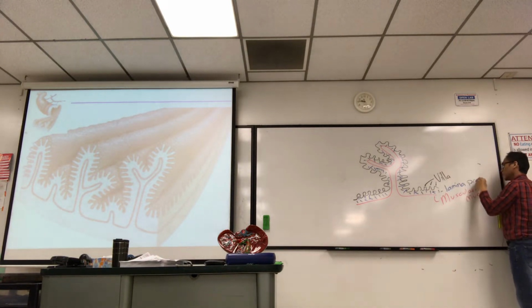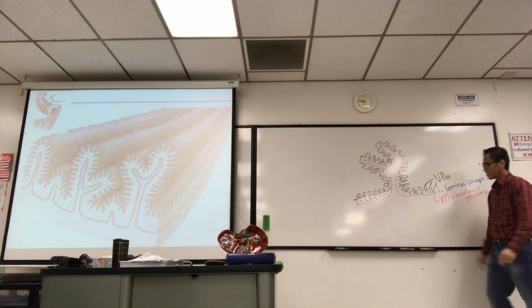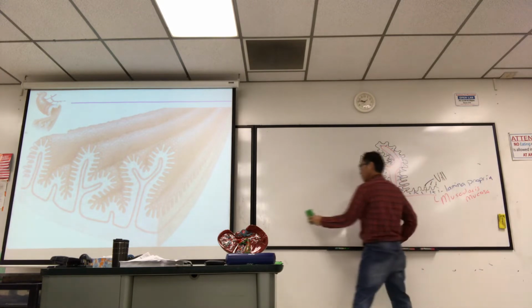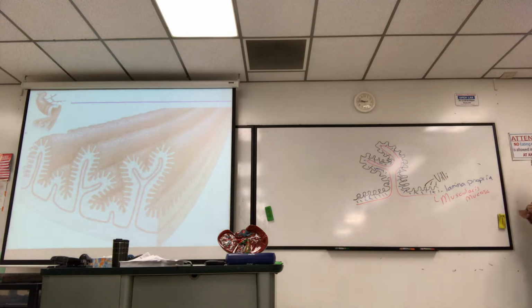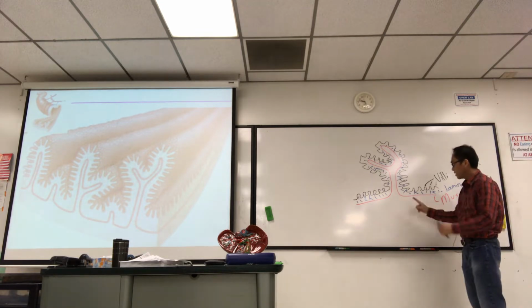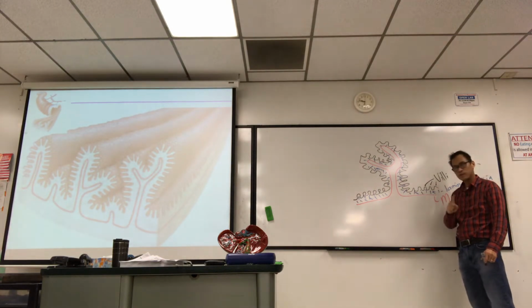Lamina propria, right? So you got the villi. I keep saying villa instead of villi, I apologize. Boom. All right, so these layers here, the epithelium, the lamina propria, the muscularis mucosa, that's all mucosa, okay? The villi is what you got. And so deep to the MM, the muscularis mucosa, would be the connective tissue of submucosa.